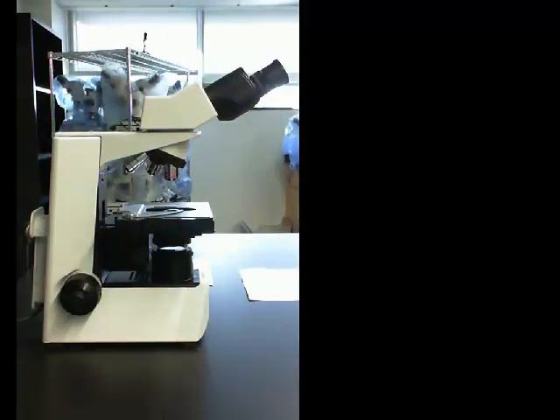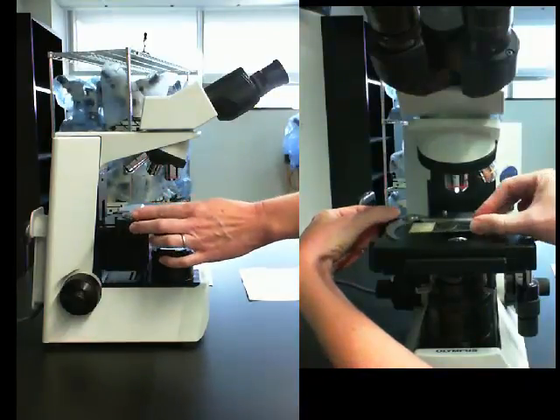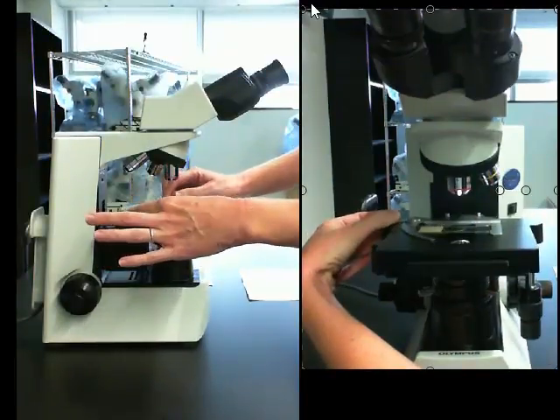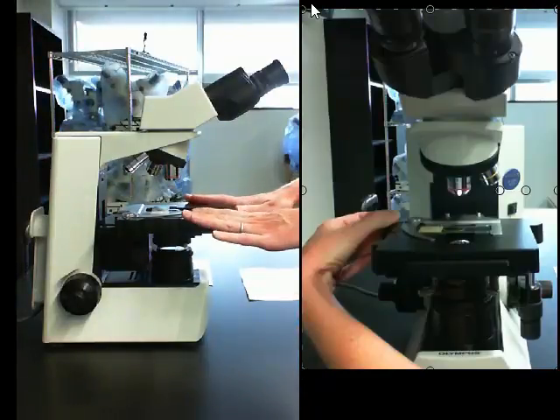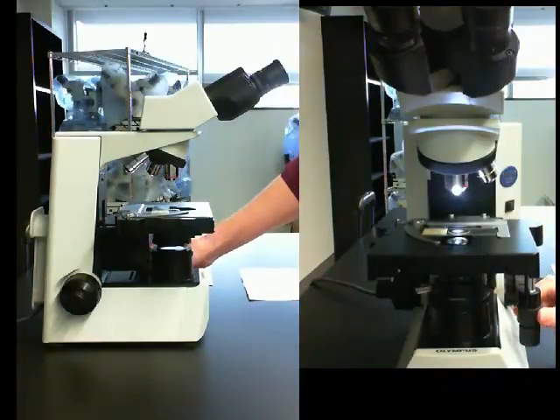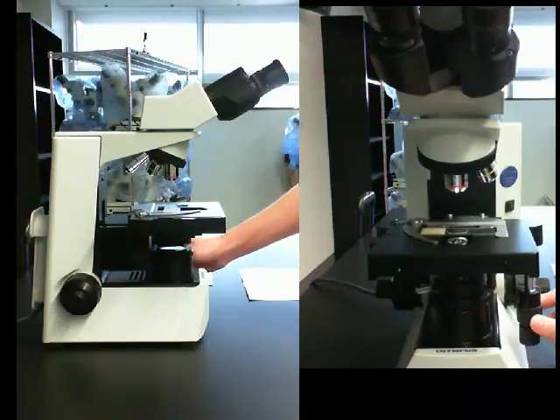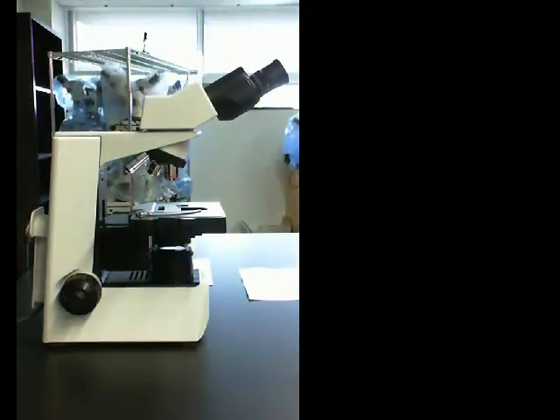To begin use of the microscope, first load the slide in between, not under the stage clips. So you can open up the clip, place the slide, and have it nestled or cradled between those 2 clips. Note that the stage is all the way down and that our objective is on the scanning objective. I'm going to turn the light on and I am then going to use my stage adjustment knobs to center my specimen, which I can clearly see here on my slide, over that circle of light.